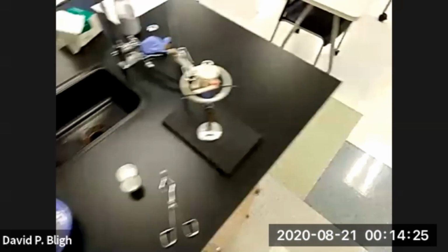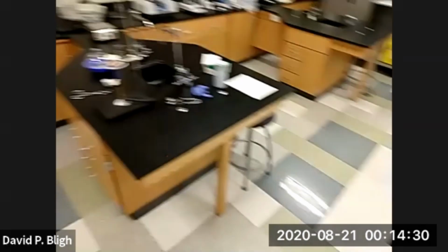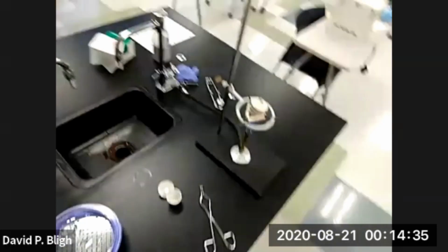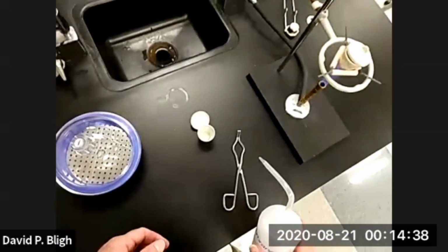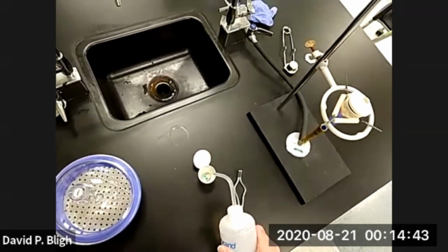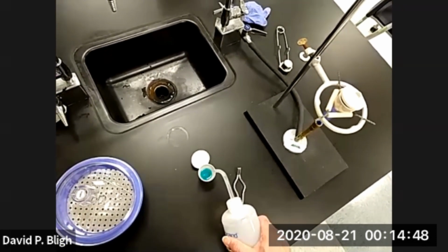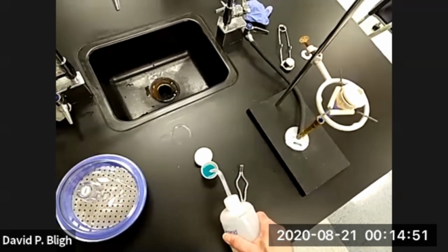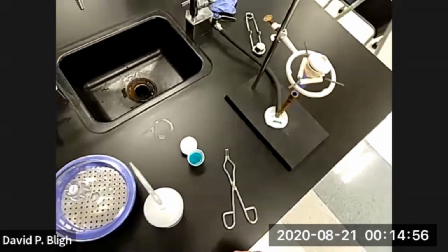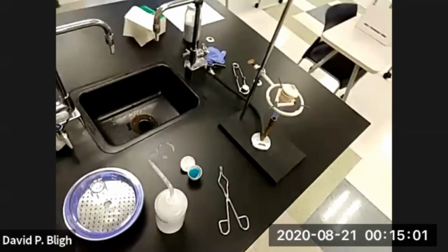All right, so while we're waiting a little bit longer, let's see, where's my wash bottle? My wash bottle, here it is. Notice, if you can see this, when I add water to this material, what's going to happen? Immediately turns blue again. And we're going to let it sit there for a little bit to help us clean out the crucible.